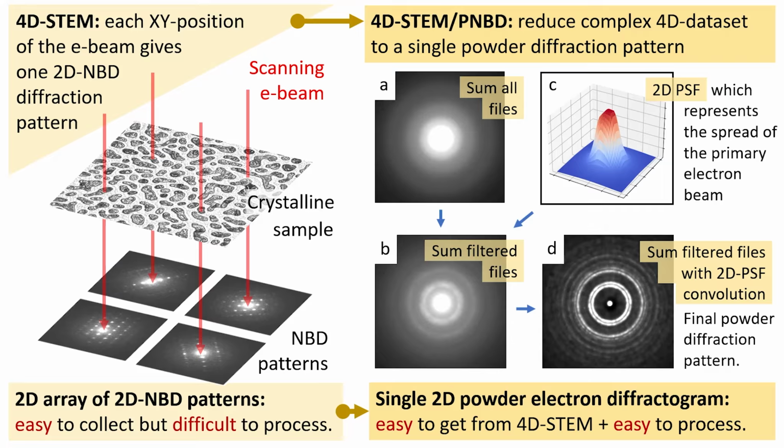What we should emphasize is that all those things are done in our software programmed with the help of Pavlina, and so the user gets this one, and this can be easily processed and used to identify the crystalline structure in your sample. Okay, so what was originally supposed to make just an image of a surface is now revealing the crystalline structure. Exactly.